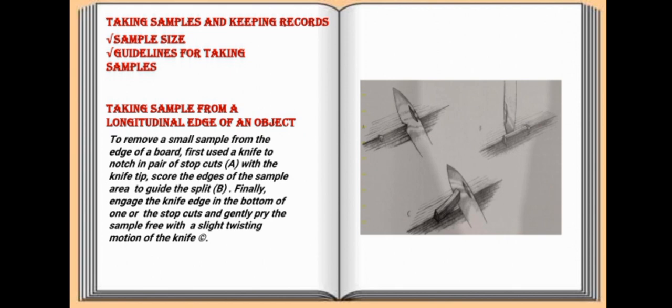Prepare slides for analysis. The proper sample size is crucial for obtaining accurate and representative results. The right sample size ensures that the sectioning process is effective and that the specimen is well represented for microscopic study.